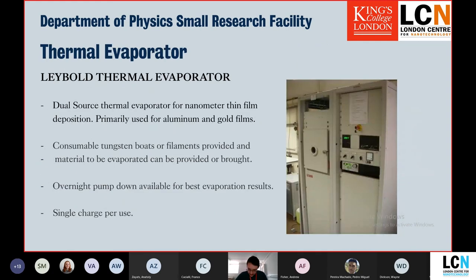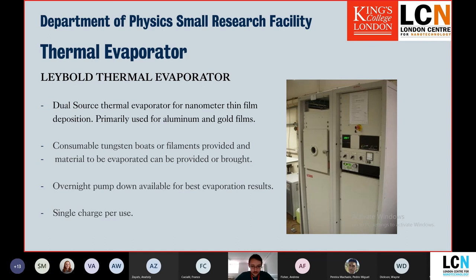We have a labelled thermal evaporator in the third basement, used for depositing thin films onto a suspended substrate. We mostly use it for gold and aluminium, but it can also be used for chrome, silver, and most metals. The device is easy to use and gives very good control over film thickness. One downside is you have to load it and leave it overnight to pump down for decent results, so we charge for a single use — while you may book it for 24 hours, you're probably only using it for about half an hour.